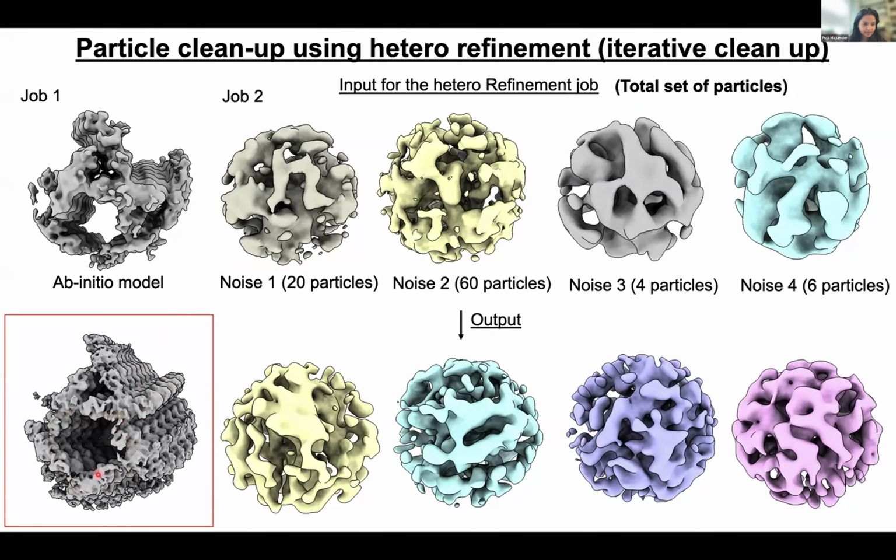So theoretically, I think it can form a very long filament. As you can see here, there are several repeat units. But what I have observed is that after a certain range, the filament starts breaking up. So what I see here is 1, 2, 3, 4, 5, 6, 7, 8, around 10 repeat units that we can see in our total map.